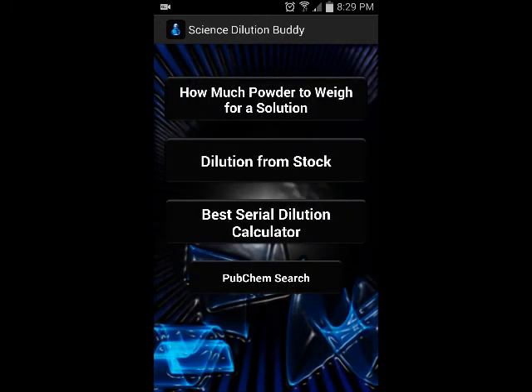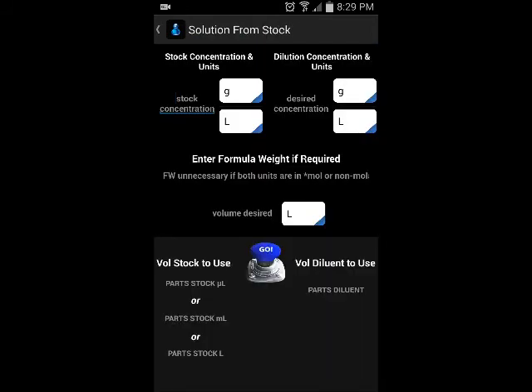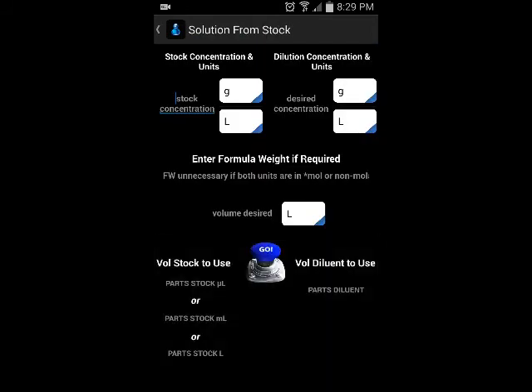That's a pretty simple section of the app. The next one is Dilution from Stock. There are several apps on the market that do this, but what's unique about this app is that you can automatically do unit conversions behind the scenes — you don't have to do any unit conversions on your own.